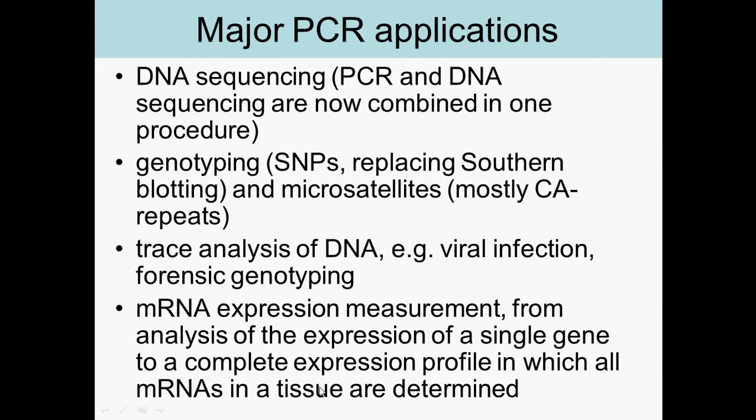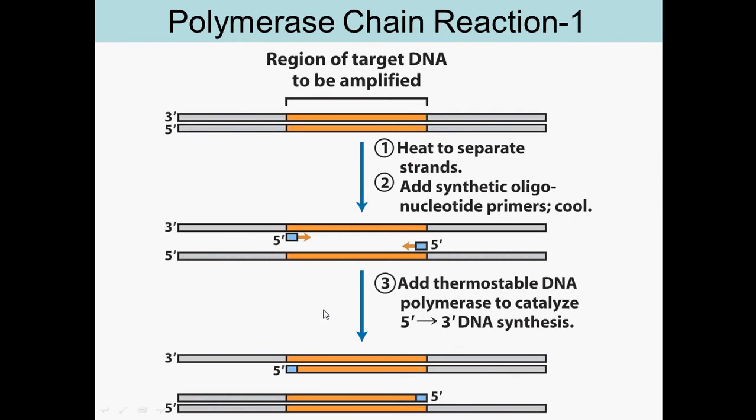And then we can measure how much mRNA is there in the cells by using reverse transcription to amplify it.